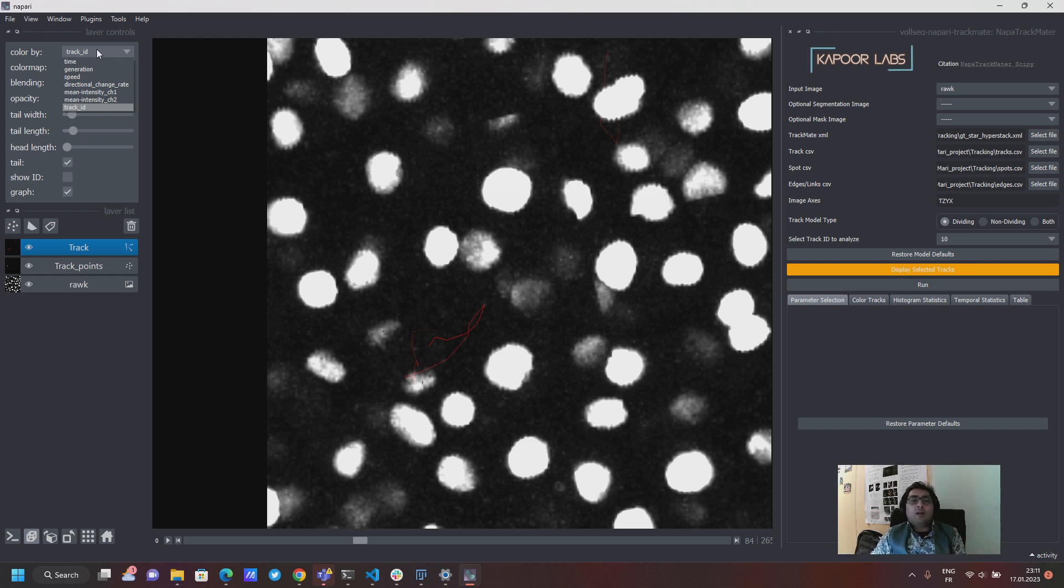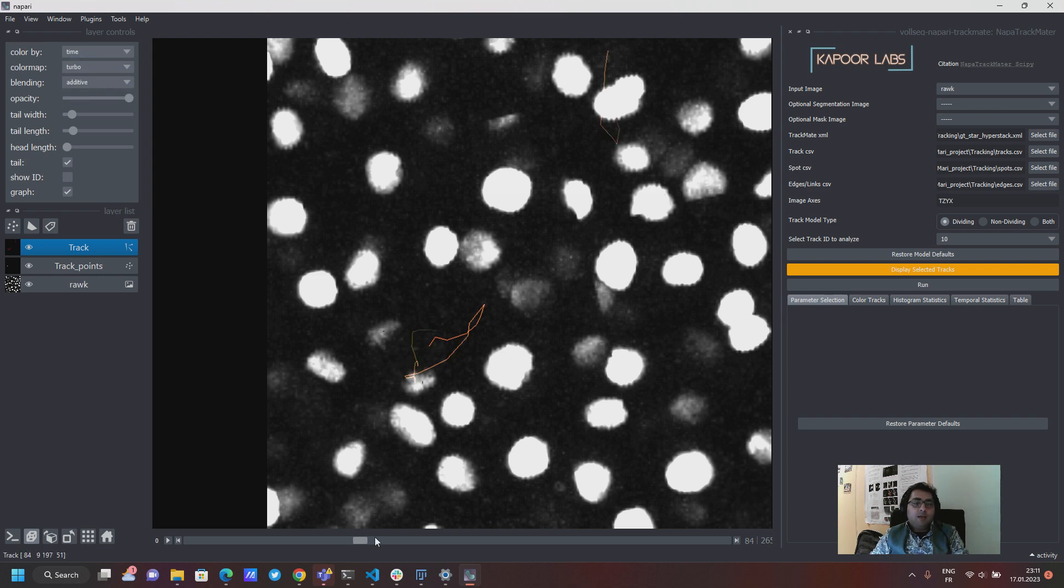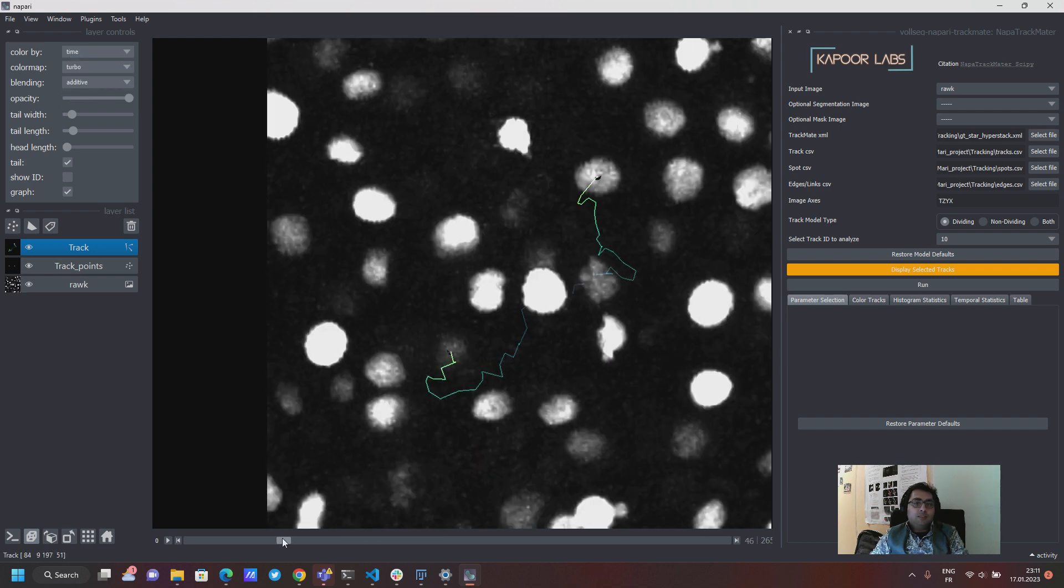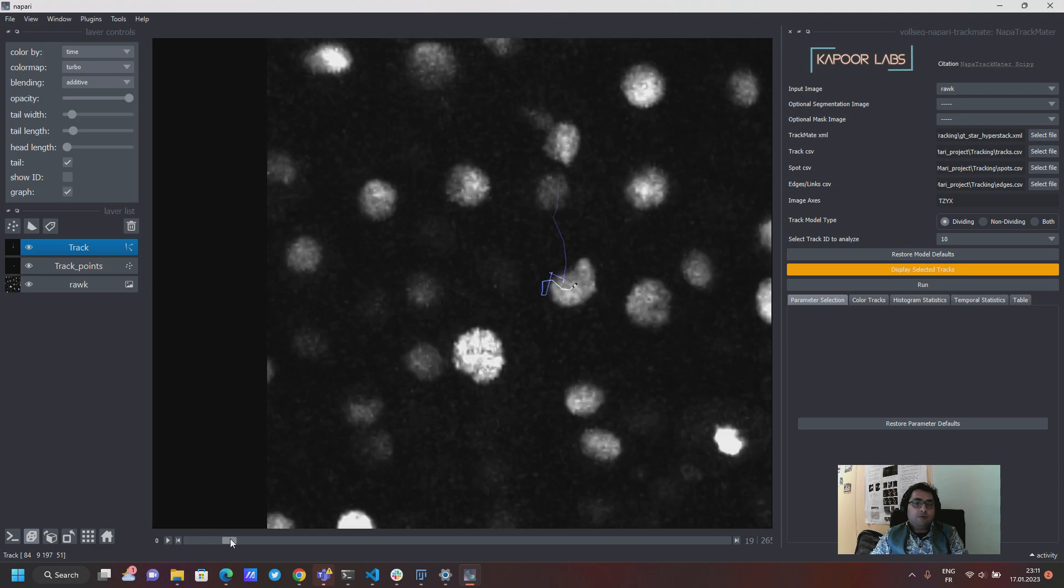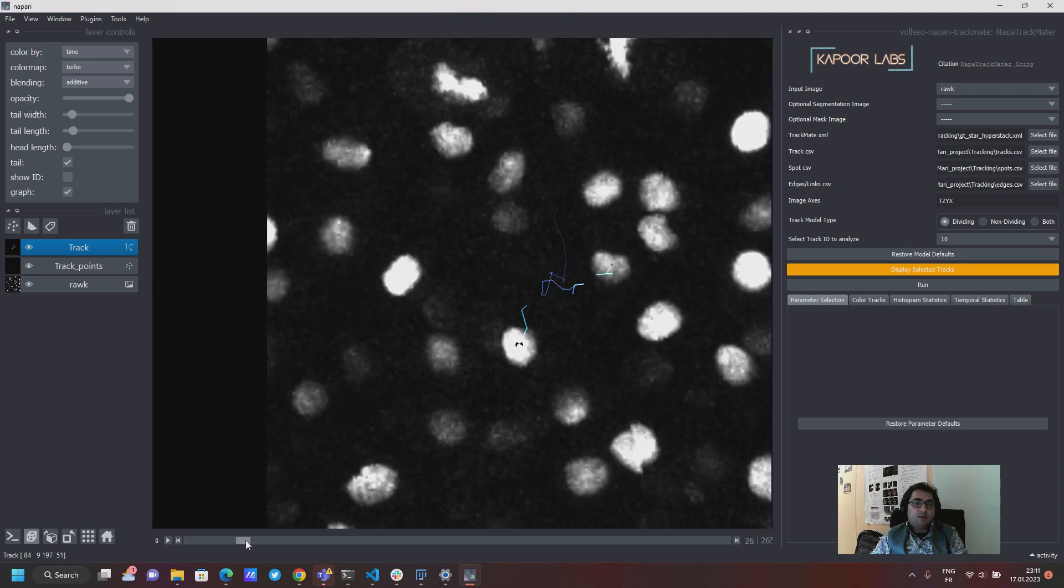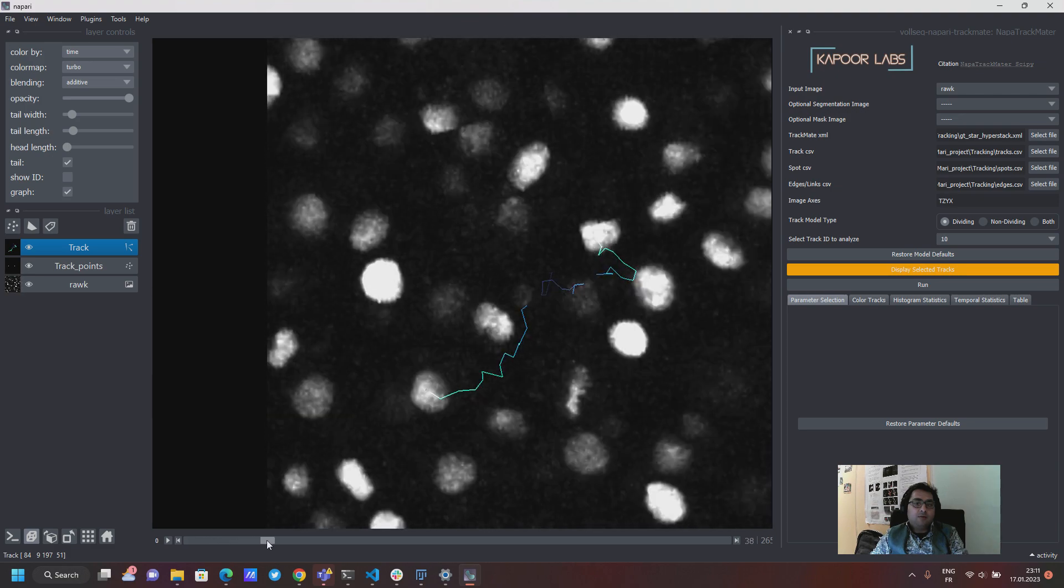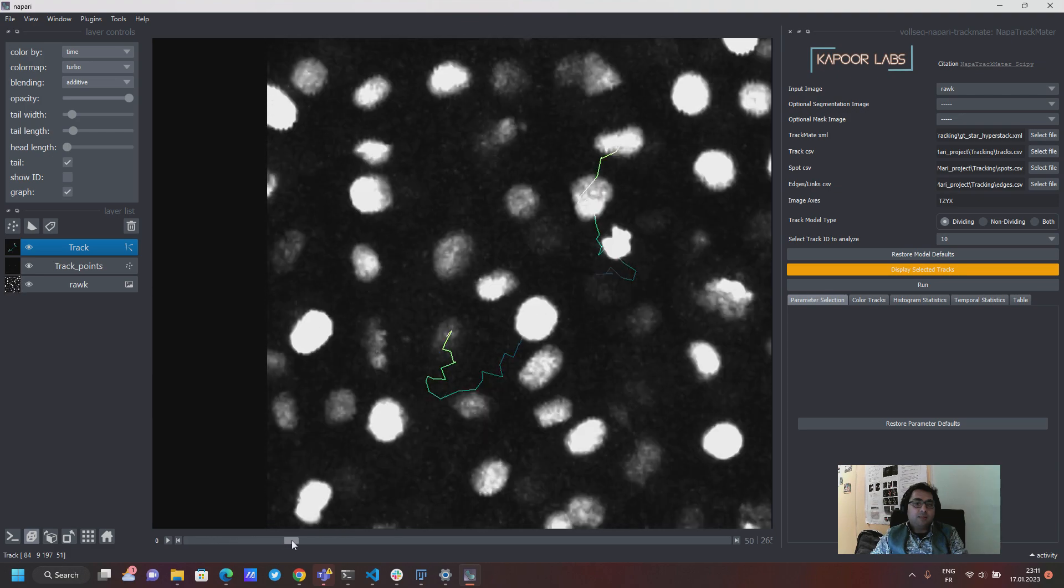So you can color your tracks with this property, you can color them with speed, and you can for example color them with time. So this is just a simple visualization of your track and the color now represents this time.